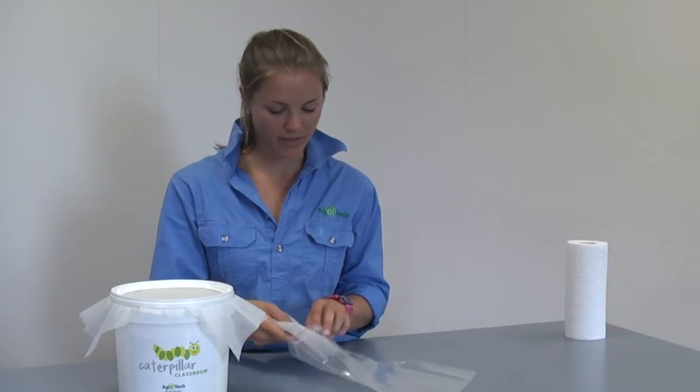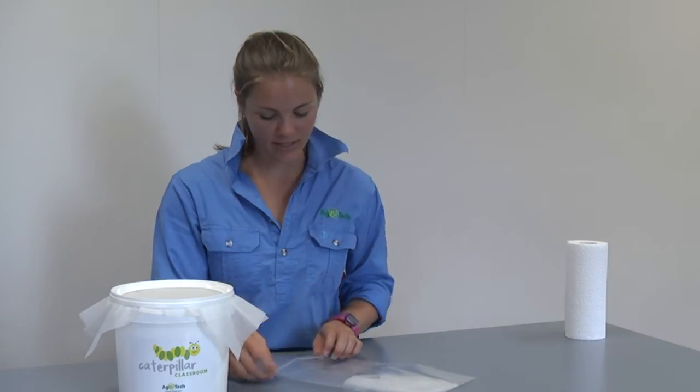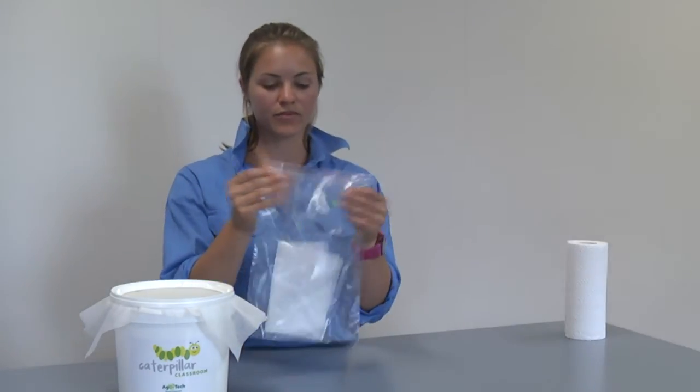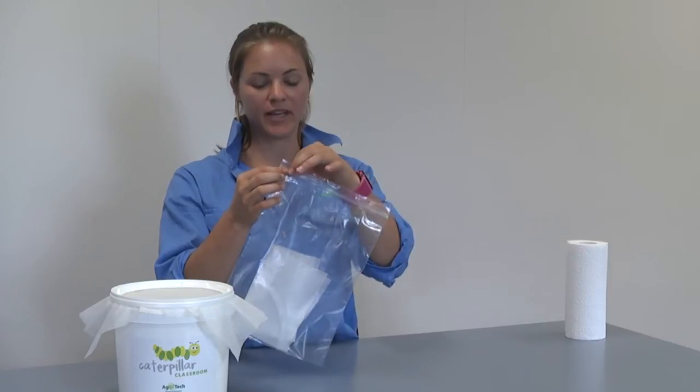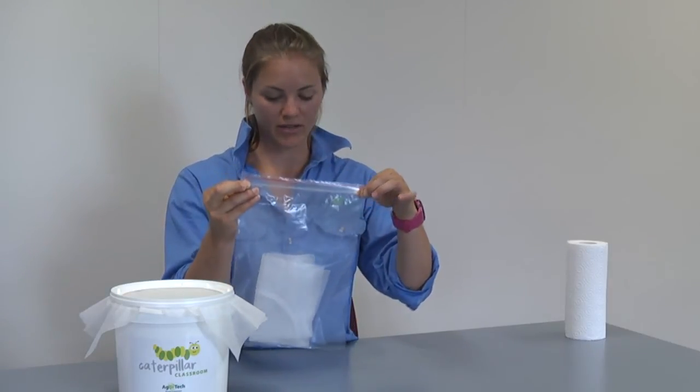Carefully fold your nappy liner with eggs on it and place it inside the zip-lock bag provided in your Caterpillar Classroom kit. Just before you close it, make sure there is some air in there so that if your eggs hatch into neonates they have oxygen to breathe. Repeat the egg collection process daily.